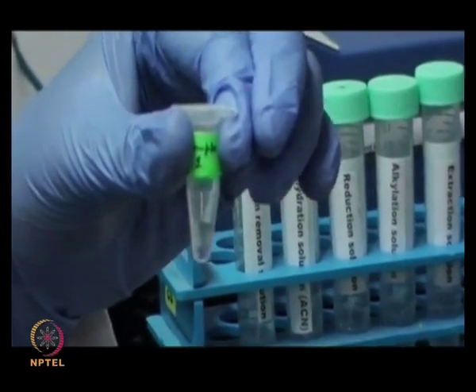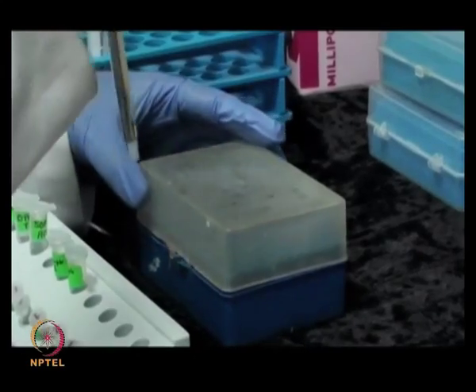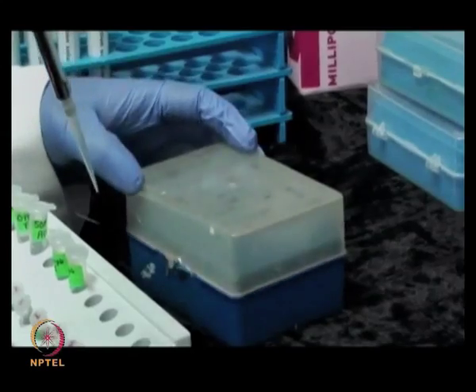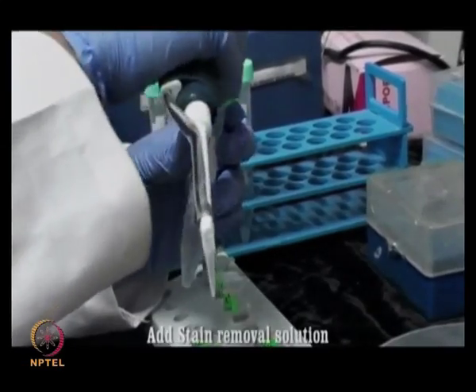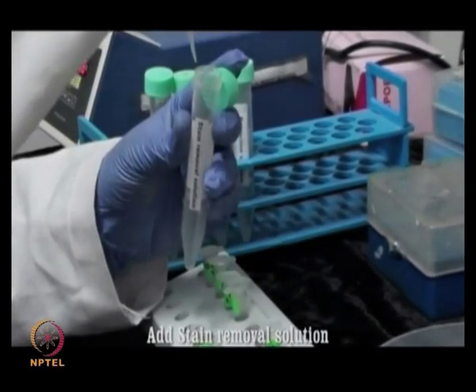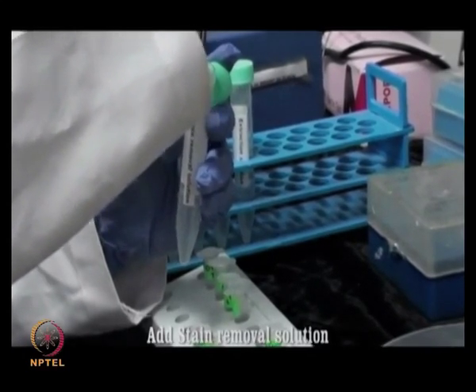Now, you can add 50 to 100 microliter of stain removal solution. For the large gel pieces, take enough liquid to cover them completely. So, you can adjust the volume depending on the size of your spots or the band.